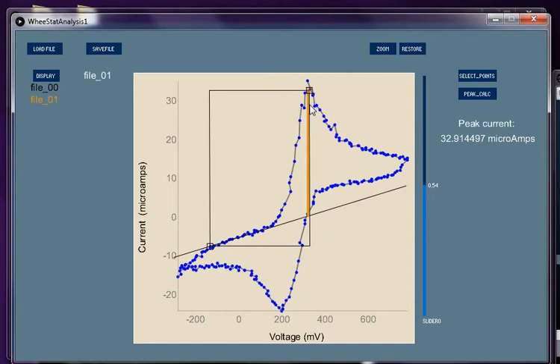Now we have this as our current peak and it says over here 32.9 microamps for the forward anodic peak. So we have one at about 33 microamps.